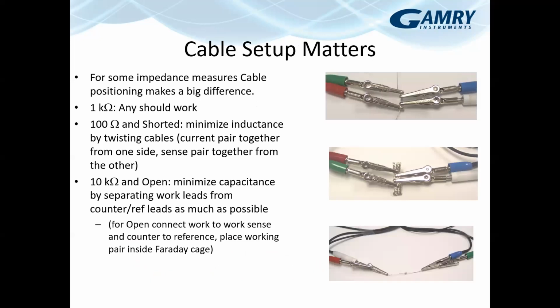So, cable setup. They said it matters, and here's what it kind of looks like. For some impedance measurements, the cable positioning makes a big difference. 1 kiloohm is kind of right in the wheelhouse of almost any system, so it generally does not matter how you make that measurement. For low impedance samples, and for a system that goes up to a megahertz, 100 ohms is actually a relatively low impedance.